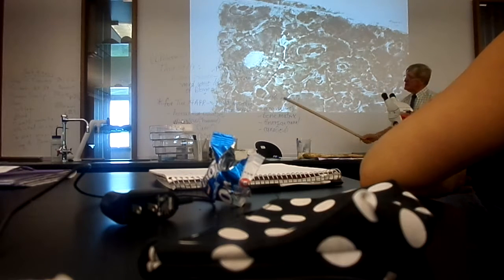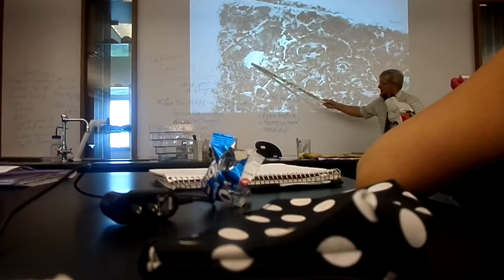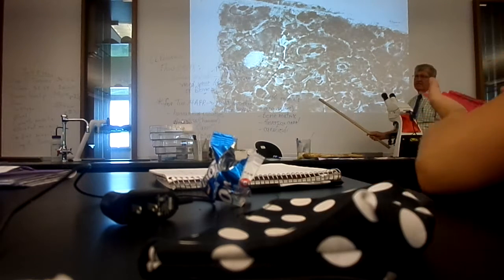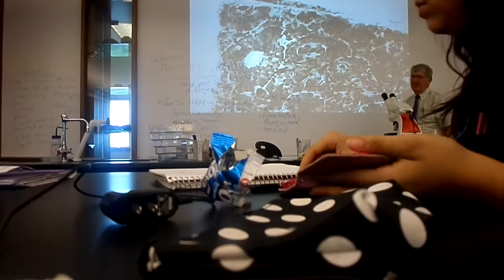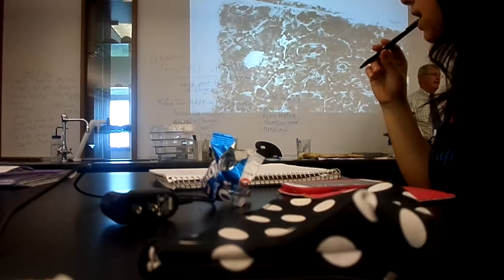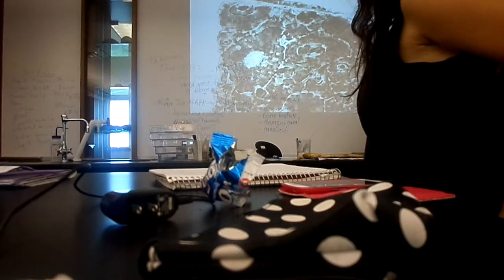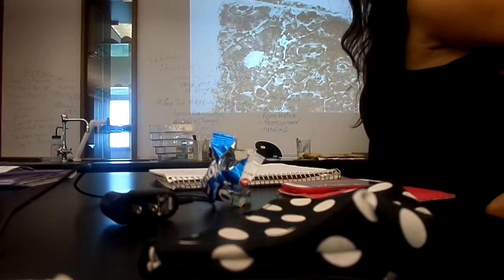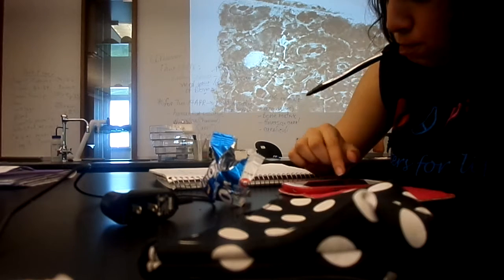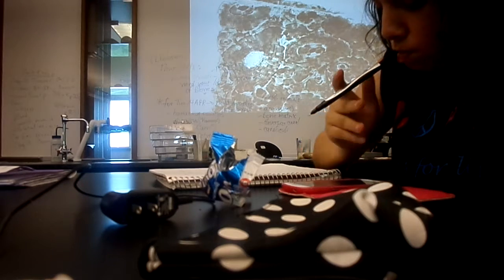Depending on shading, it's either going to appear light or it's going to appear dark. But it's a hole. And this hole was occupied in the living tissue by an artery, a vein, and a nerve. But those structures also are no longer present.